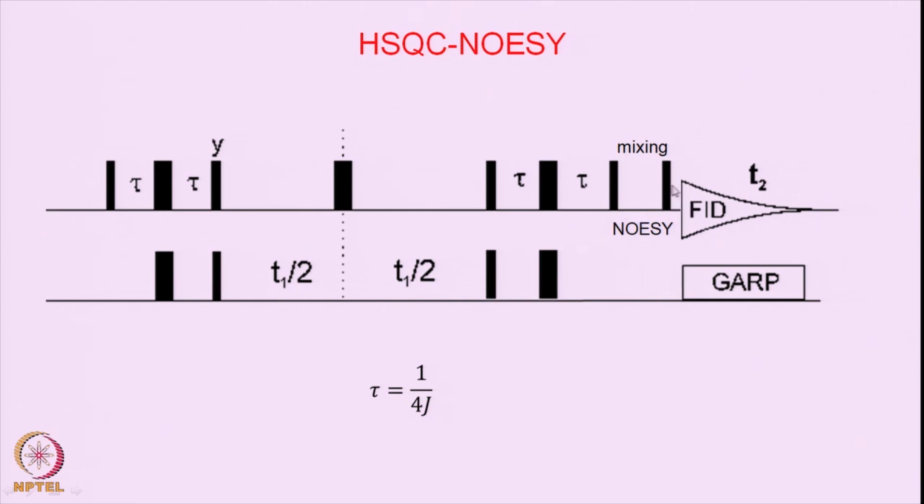So earlier it was J coupling mixing in the TOCSY, now here it is a dipolar coupling mixing. So there is a relay of magnetization from the Z of one particular proton to another proton. And then after that, of course, at this point if I take 2 protons A and M, I will have a mixture of IAZ and IMZ, where the relay has happened through the dipolar interaction during the mixing period. And then of course you collect the data. Since it is Z magnetization, this last 90° pulse converts the Z magnetization into transverse magnetization, so that you can generate in-phase transverse magnetization, and you collect the data here as an FID, and this will contain frequencies of both of the spins. And you can decouple here, since it is all in-phase magnetization. And all other parameters remain as they are in the HSQC.